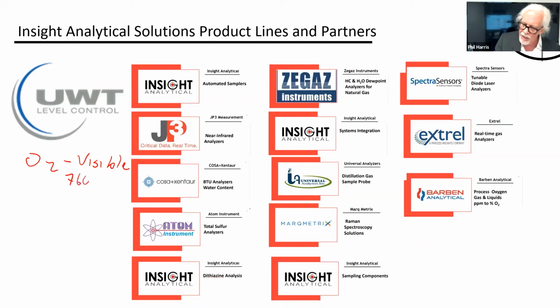visible laser right on the edge of the red spectrum, 760 nanometers. It's actually because of that potential transition that oxygen can quench the fluorescence. You notice that we get a fluorescent signal in the red, and oxygen quenches it because 760 nanometers is right in the red, and that's where it pulls the energy away. So these ones, the 760 nanometer lasers, as far as I know, were never used in the telecom industry.